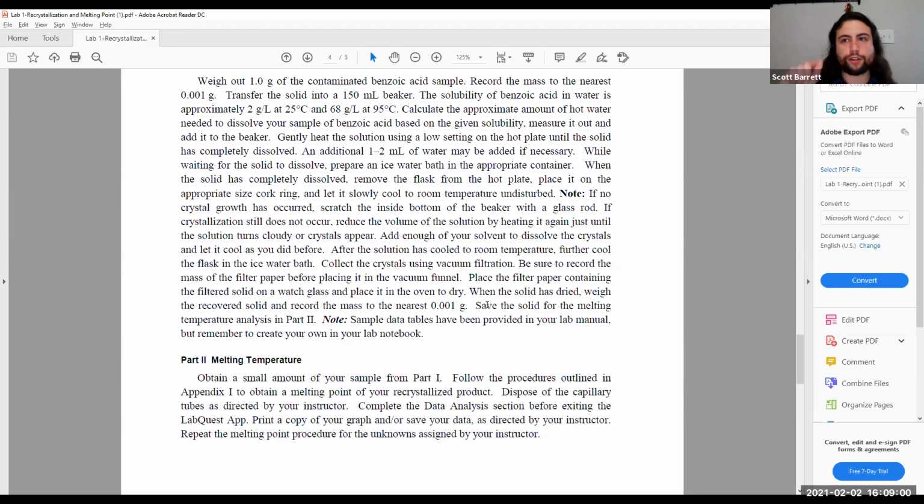So you need to make sure that you weigh the filter paper, and the filter papers are made industrially. So one filter paper can be 2 grams, one can be 5 grams. It's not really a standard, cut-and-dry amount for the weight. So you would weigh your filter paper, and then you go perform the experiment. Get your crystals on the filter paper, dry it, make sure that it's as dry as possible because water can also skew the weight. Then you go forward and you would weigh the crystals on top of the filter paper on your scale.